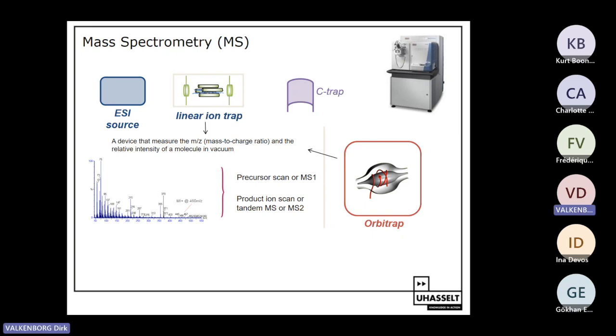And we accumulate a bunch of those ions, like thousands or 2,000 or maybe up to 10,000 of these same ions with the same mass. And then we will start to fragment these, and I will later on explain the fragmentation process. But you have to trust me on the word now. These peptides will break and will exhibit a special fingerprint that is predictive for their amino acid sequence.